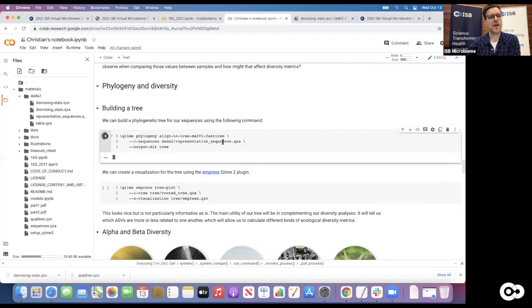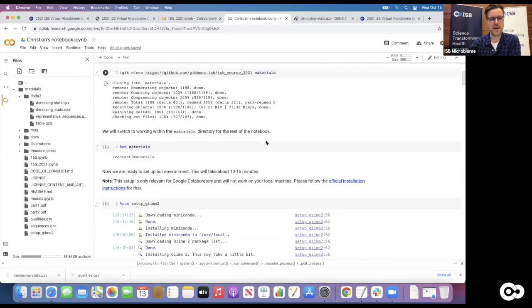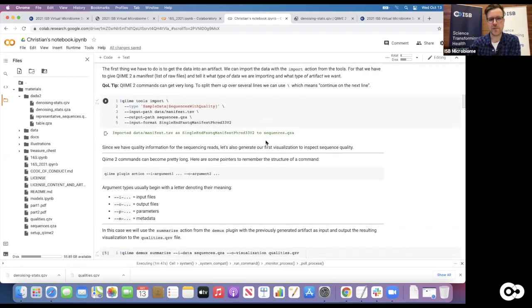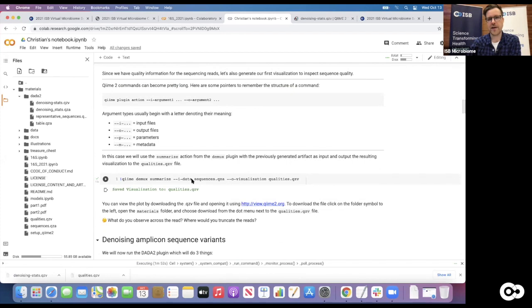Okay, yeah. Rarefaction, we will talk a little bit about that in a few minutes or maybe after the break, since we're getting really close. That's definitely something we want to look at. And then, yes, if you want to know how many reads your samples have, that was one of the first steps, and that's why we ran that. We generated that artifact from the raw sequencing data, and then we had that quality visualization file.